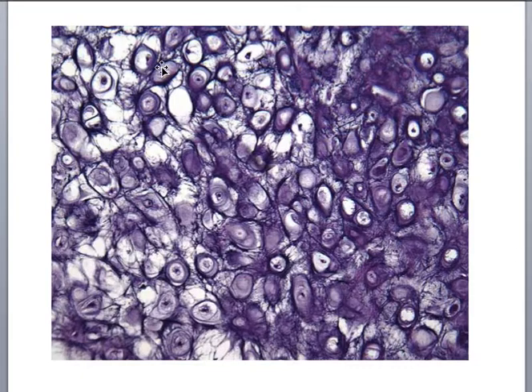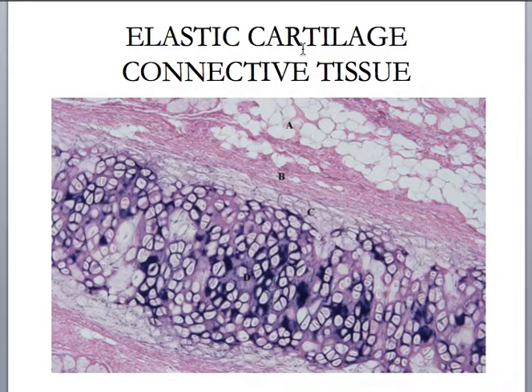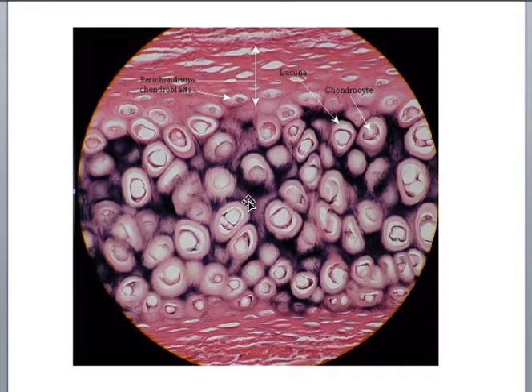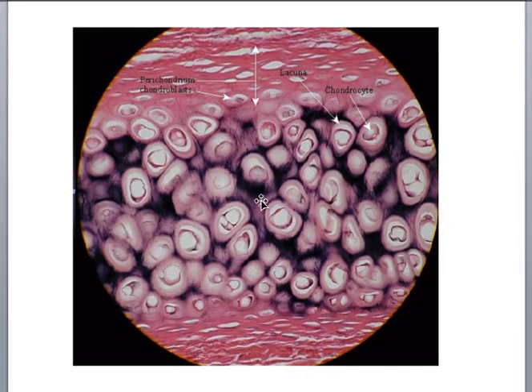At high magnification, here are the chondrocytes in their lacunae. And look at that — those little hairs. Those are elastic fibers. That's why it's called elastic cartilage. That ground substance has abundant elastic fibers. This makes elastic cartilage not nearly as glassy because it has all of those dark staining elastic fibers in the extracellular matrix. All the other structures are the same, though. All those elastic fibers in the extracellular matrix make elastic cartilage more elastic than hyaline cartilage, but it's still pretty protective because of that gel-like extracellular matrix — that semi-rigid, semi-solid ground substance.